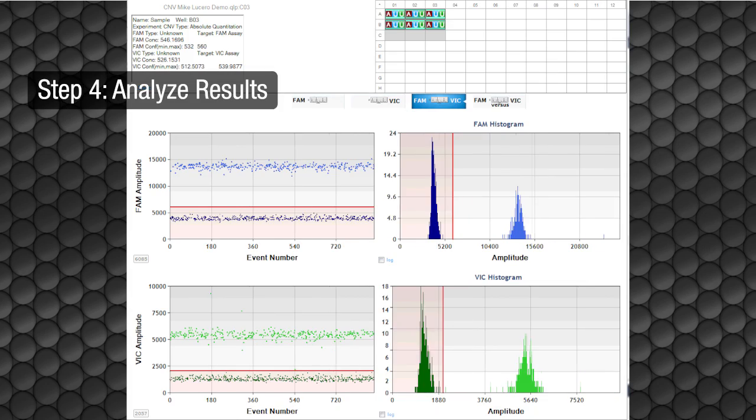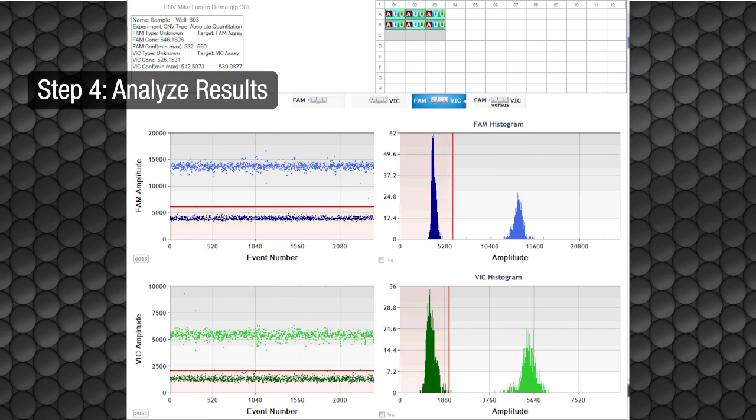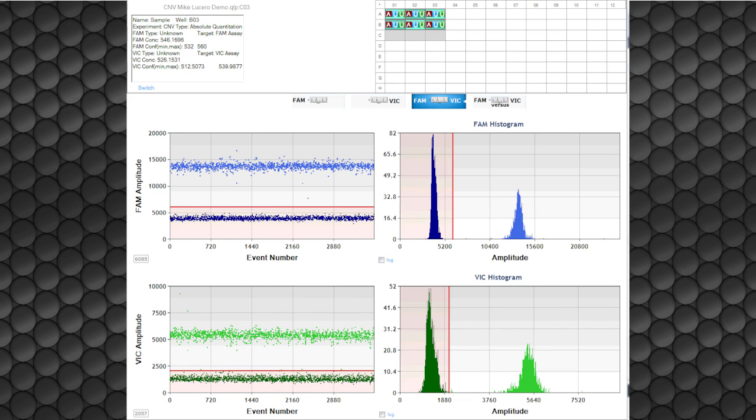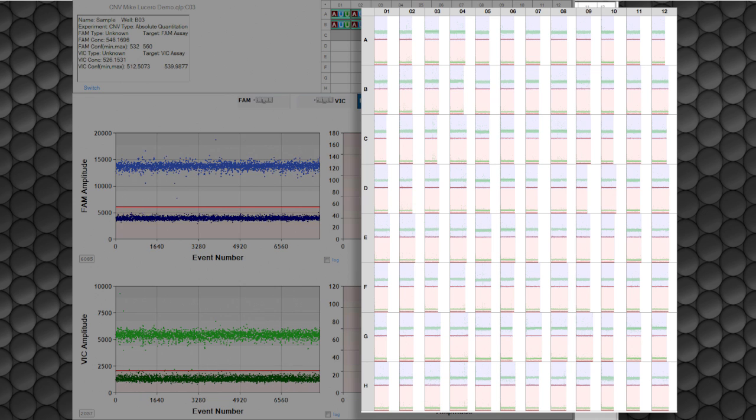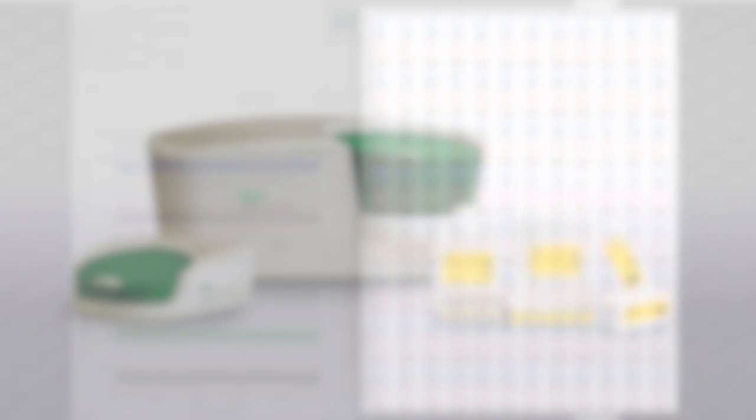As each droplet is read, the data are recorded graphically by QuantaSoft software. The software records the positive and negative droplets in each sample and plots the droplet-by-droplet fluorescence. This allows the data to be analyzed and visualized according to the specific application and research requirements.